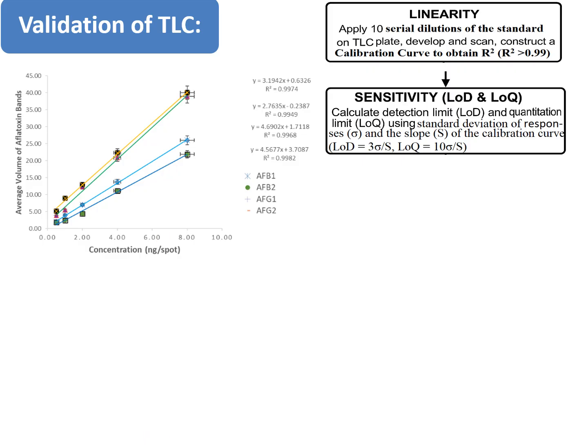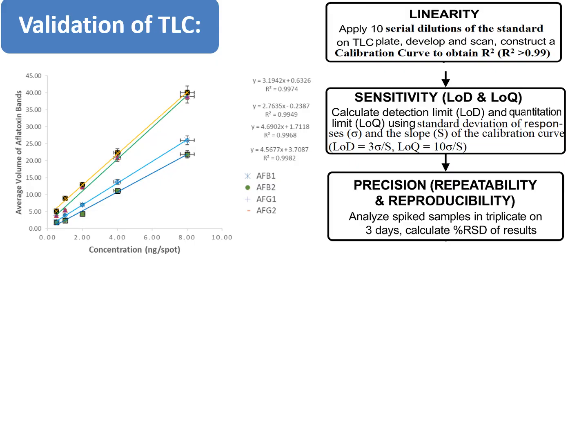Now, the next parameter that has to be evaluated during the validation process is the precision of the method.